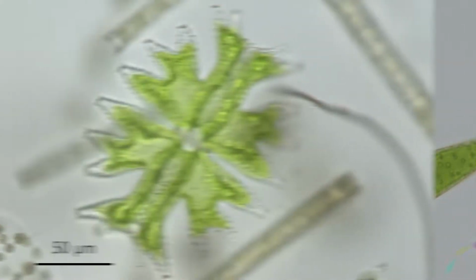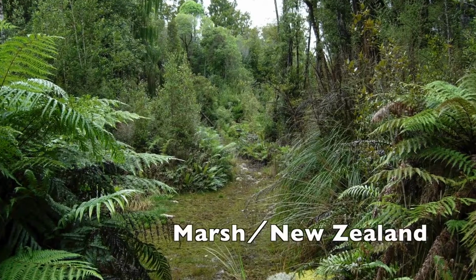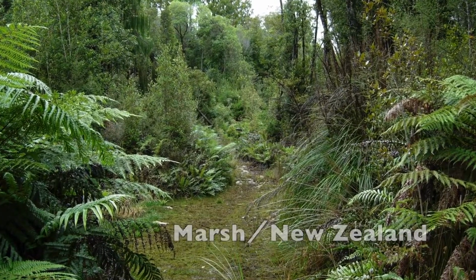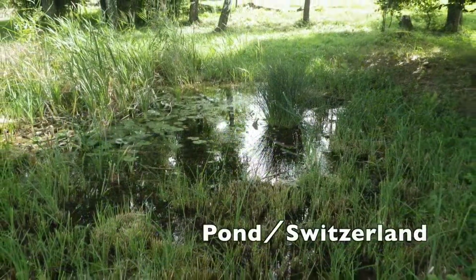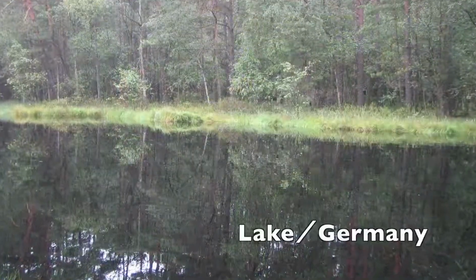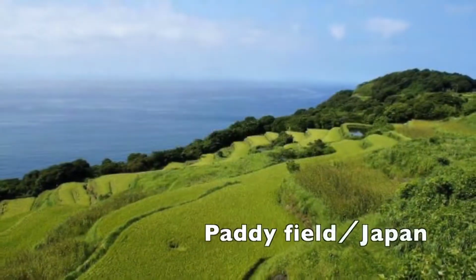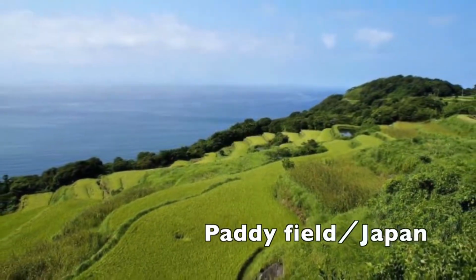Here, we focus on unicellular conjugatophytes, in which a variety of forms are identified. Unicellular conjugatophytes grow in stagnant freshwater areas such as lakes, marshes, and paddy fields. From these environments, an algae-containing water sample is collected to produce a culture strain.